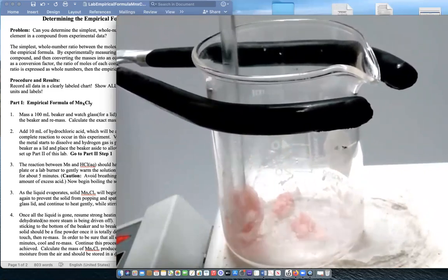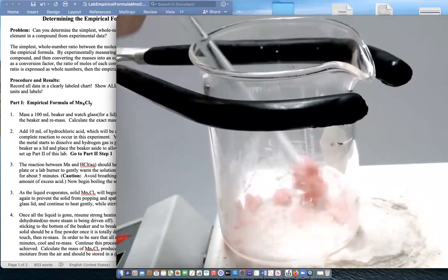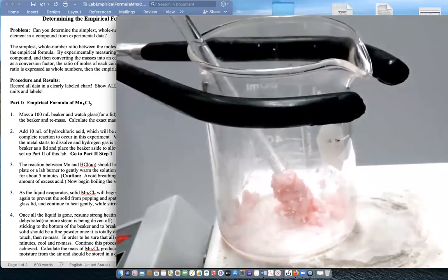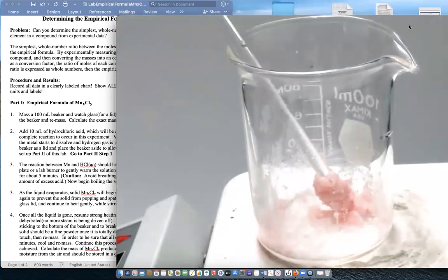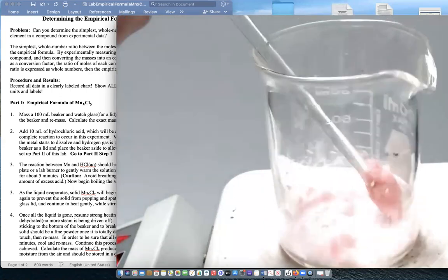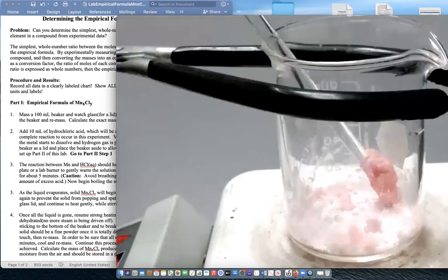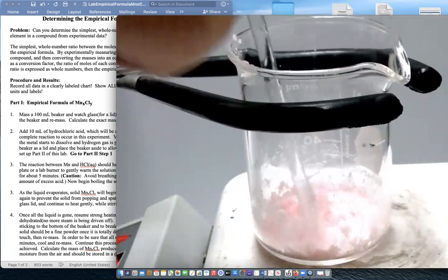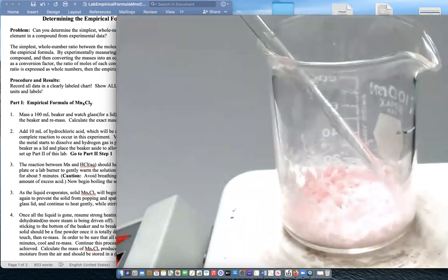Towards the end, you have to bring in your metal spatula just like we did before and try to make sure we don't lose any of this pink solid that we have. And I'm going to speed up my video and then take a look at the results when we come to the final end. So I'm a little bit more impatient, so you'll notice that we're going at a little bit faster pace here. I'm heating it up, I'm stirring it, I'm grabbing it again, I'm moving it around. I try to scrape some on the top of the beaker. So patience, patience, my child.